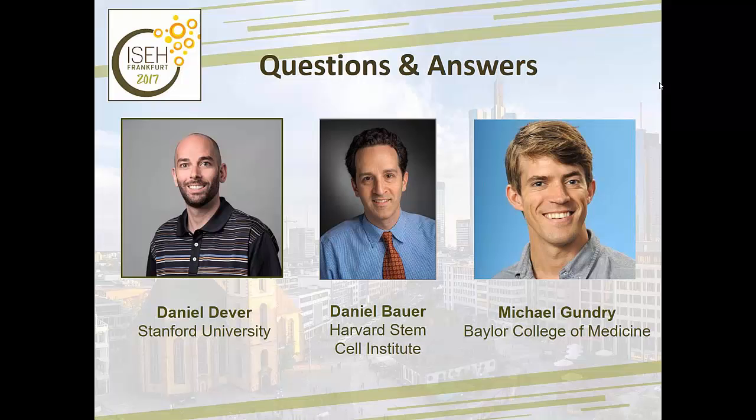Well, controls are always important. I think we are seeing that depending on the context, DNA cleavage itself can have some biologic significance to cells. So a target at a neutral locus can probably be the most equivalent control for any locus-specific effects, taking into account that Cas9 has cut somewhere at a similar copy number as your target locus, and that the DNA repair response has been activated.